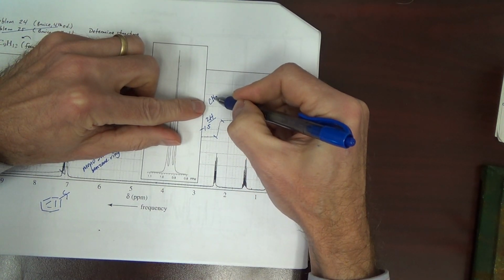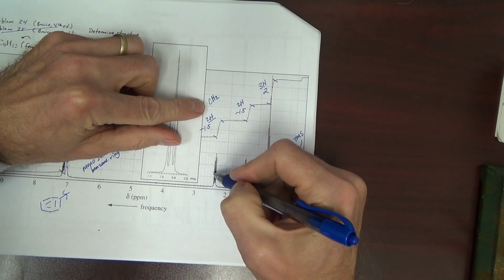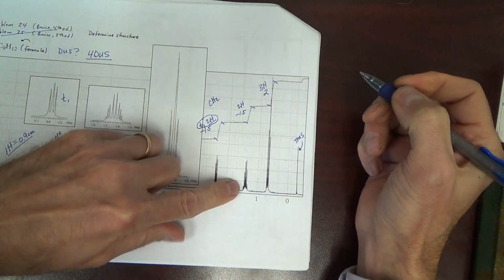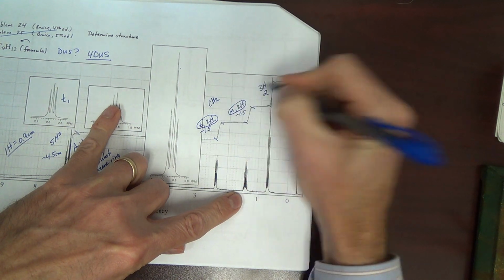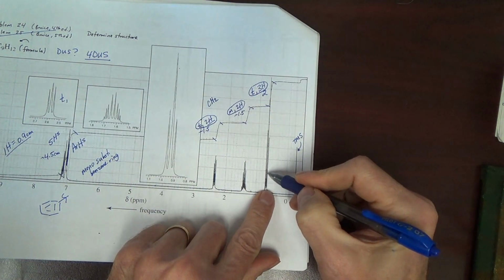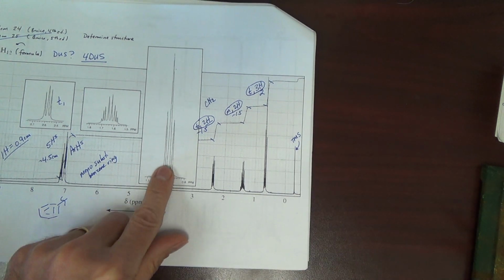These H's are going to be identical. They give one signal. But what will make it a triplet? This is thus a triplet 2H. This is a multiplet 2H. And this is a triplet 3H. 3 lines. Okay? If you can't see it there, it's been expanded for you here.